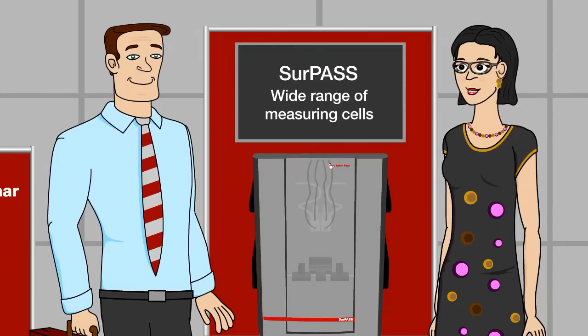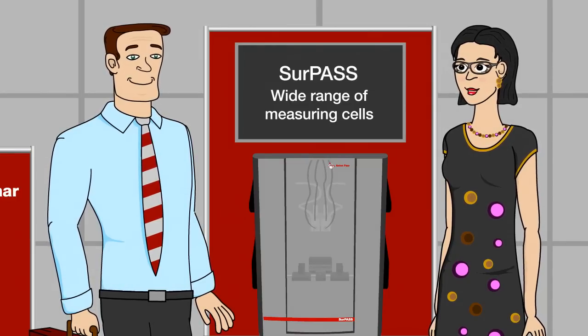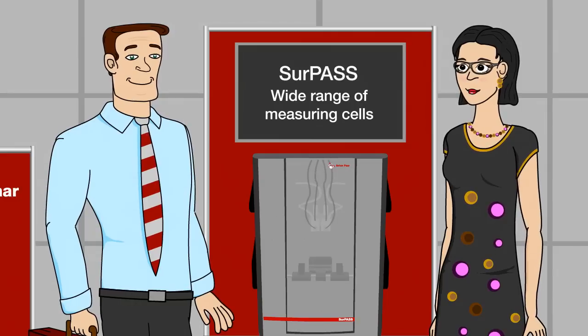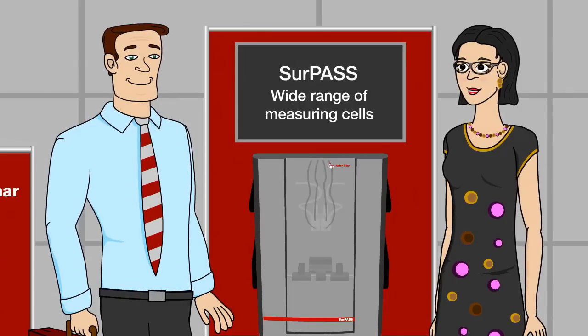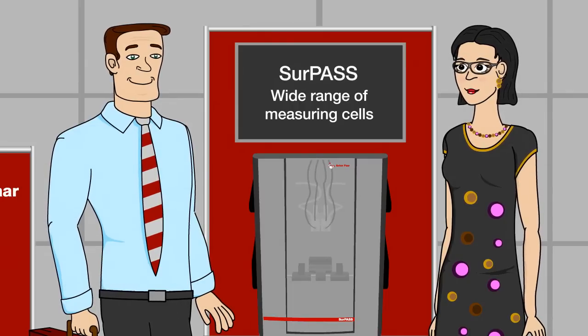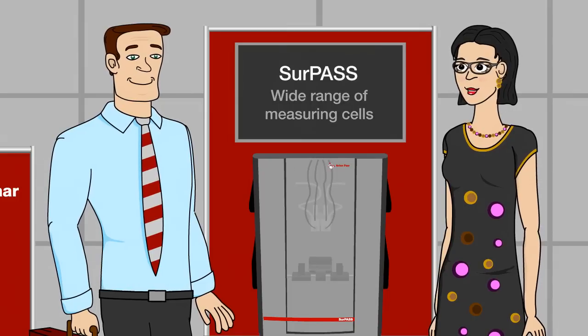Another plus is SURPASS's wide range of measuring cells. You can measure planar samples, that's rather common. But SURPASS is also open to many more sample geometries. You can measure fibers, medicinal tubes, powders, large disks, and much more. SURPASS is the only instrument that gives you that kind of flexibility.